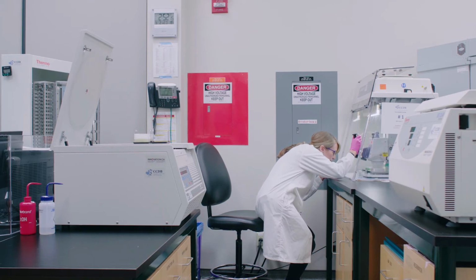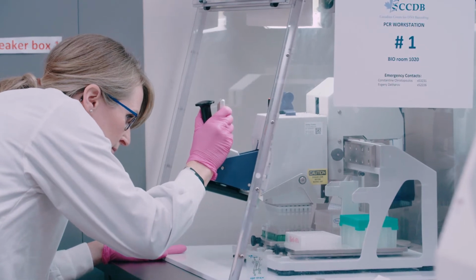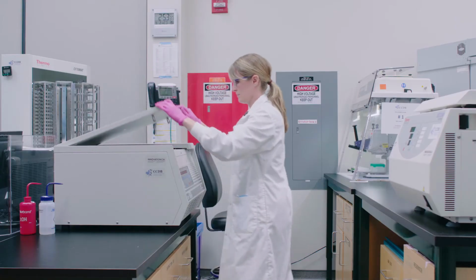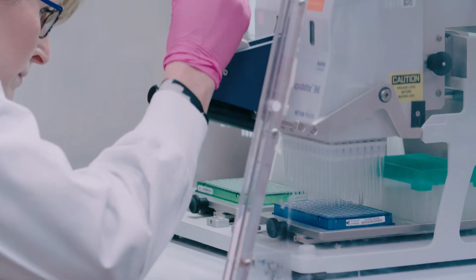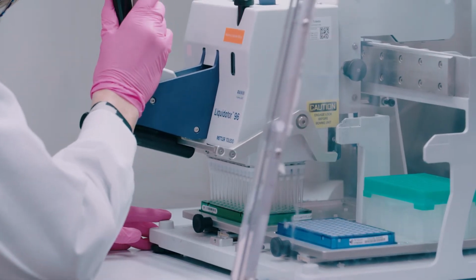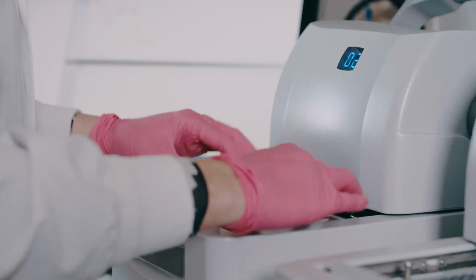Now we're ready for extraction. We'll do a liquidator transfer into this fume hood, and then we'll spin it in our centrifuge and go through the elution process. This DNA extraction procedure is standard for single sample DNA barcoding and bulk metabarcoding. Now that we've done our extraction, it's time to run a PCR. We'll transfer our samples into a pre-made PCR plate and load it into our thermocycler.